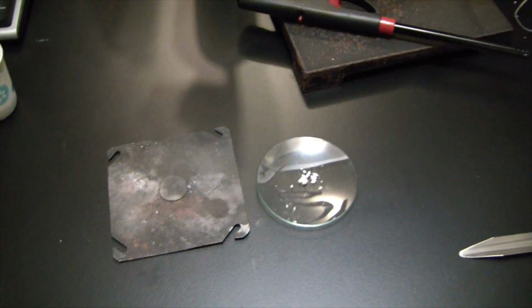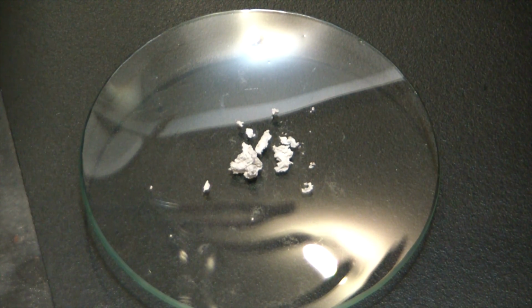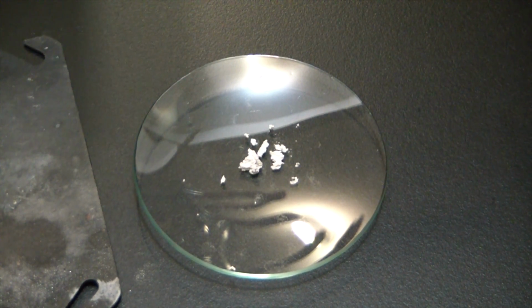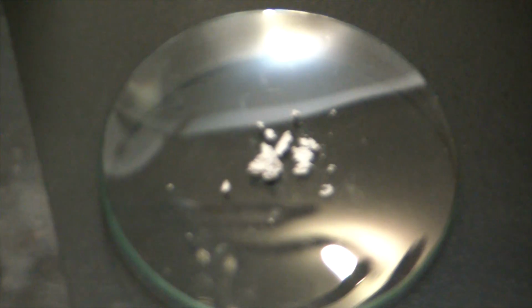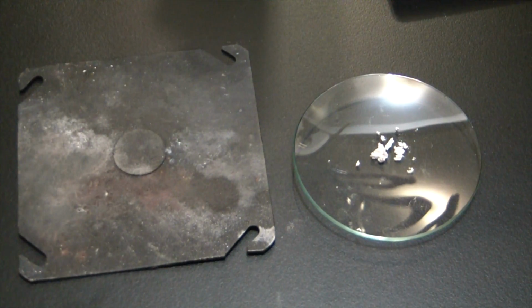So here we are a day later, and you can see the dry silver acetylide here. Focus. There we go. Anyway, so we got the silver acetylide all dried out, and we're just going to do a little test here. You can actually see nice white color, which indicates our purity is very high.